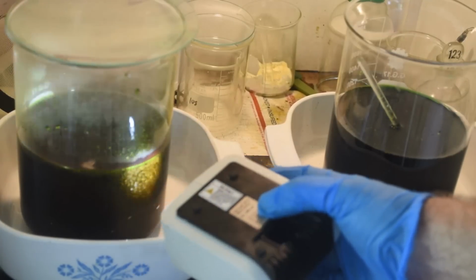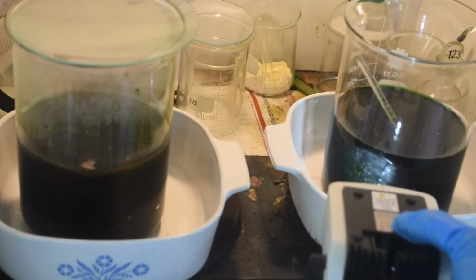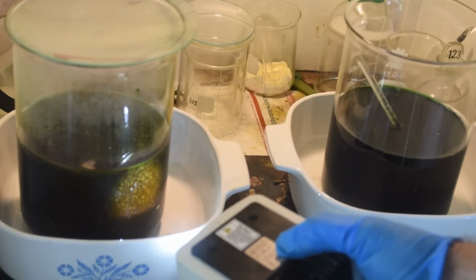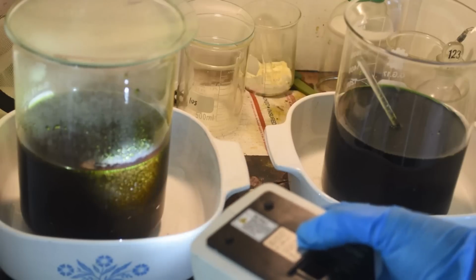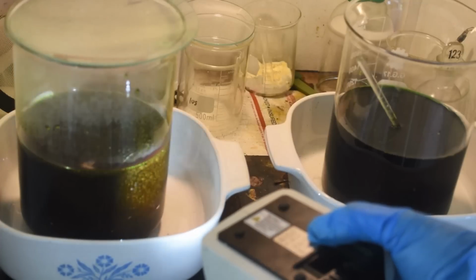See the red? And the liquid has gone a muddy reddish brown, whereas this liquid, which I haven't done anything with, is still green. So, yeah, this has done its thing. It's just that this was a little more diluted than the last stuff, so we didn't get quite as vigorous a reaction. We didn't get a bunch of stuff bubbling up out of it, but we did get a reaction.